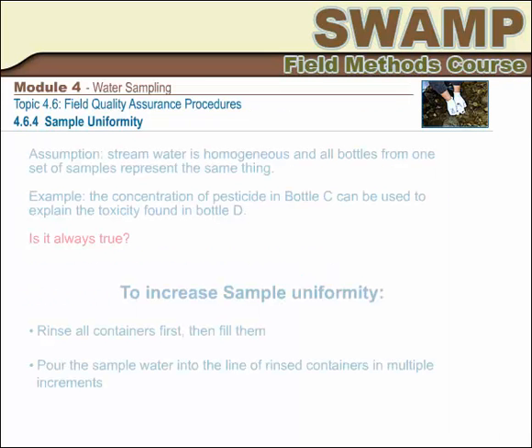In most sampling events, you will need to fill more than 1 container of water at a given station, and all the containers in that set are considered one sample. Experience tells us that tracking sample containers, each with its unique collection time, may lead to logistical problems if the number of samples is big, and if they are grouped in sets that are supposed to represent one point in time and space. For this good reason, swampers usually write the same collection time on all the jars and bottles collected in one set of samples, that is, all the samples collected at the same station visit event.